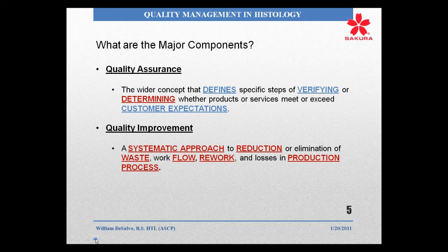And you're all about trying to reduce and doing a reduction or elimination of waste. In histology, our biggest waste is time and/or rework. And in today's laboratory, you need to be aware of what your workflow is and any loss in the production process. Loss in the production process is an unacceptable slide, an unacceptable stain. Loss of production in your production process is definitely a waste, and it's rework.